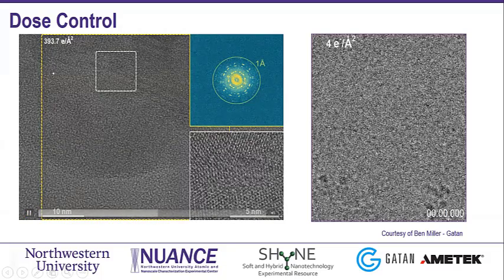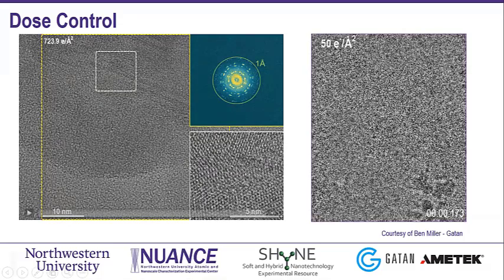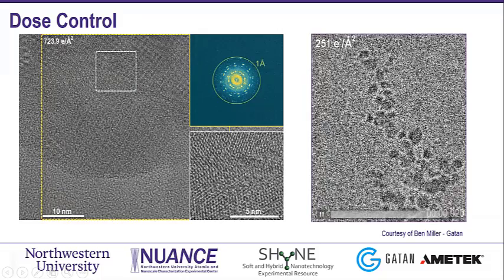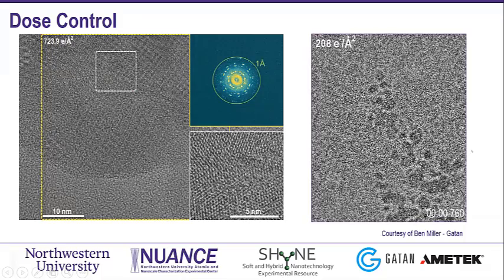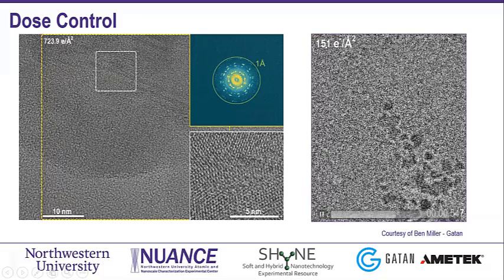So you can really control the dose while you acquire your data. And then I'm going to show you later on the live demo as well. And really, this is a TEM mode just for reference. And you can really follow the morphology variation here while you control the dose, right?